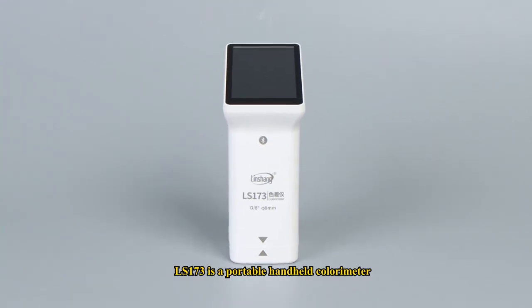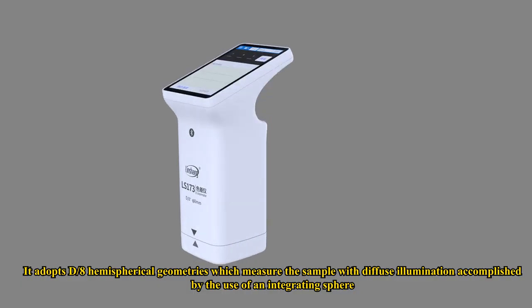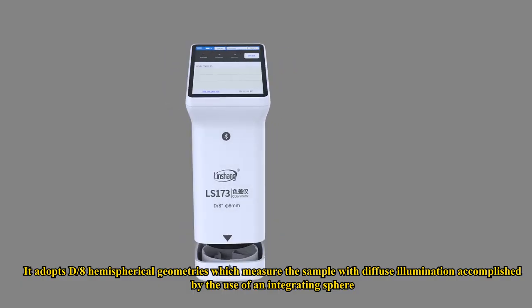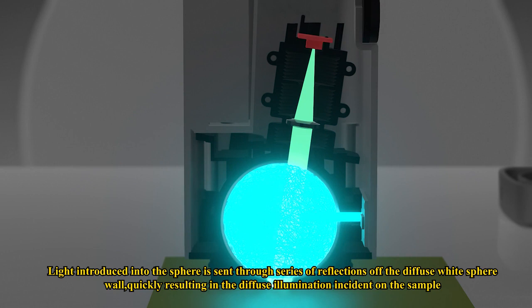LS-173 is a portable handheld colorimeter. It adopts D/8 hemispherical geometries, which measure the sample with diffuse illumination accomplished by the use of an integrating sphere. Light introduced into the sphere is sent through a series of reflections off the diffuse white sphere wall, quickly resulting in the diffuse illumination incident on the sample.